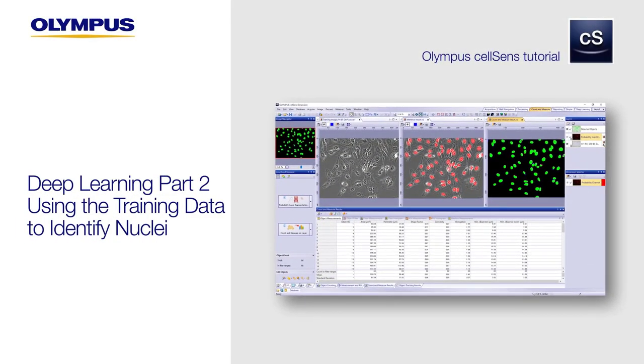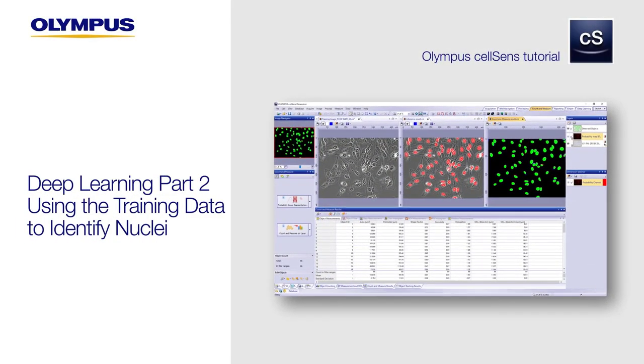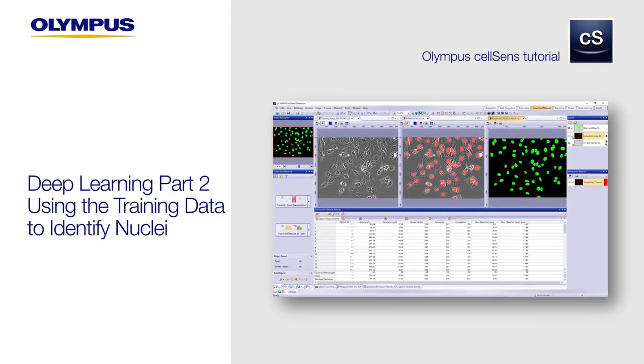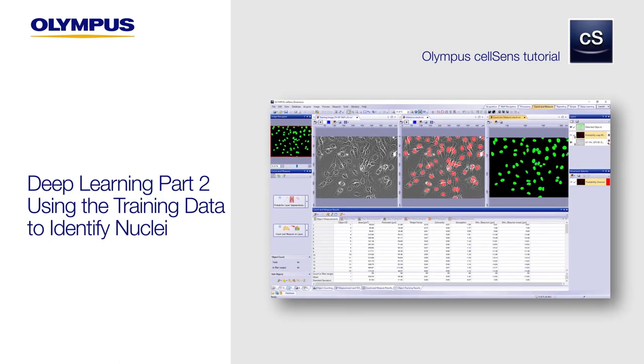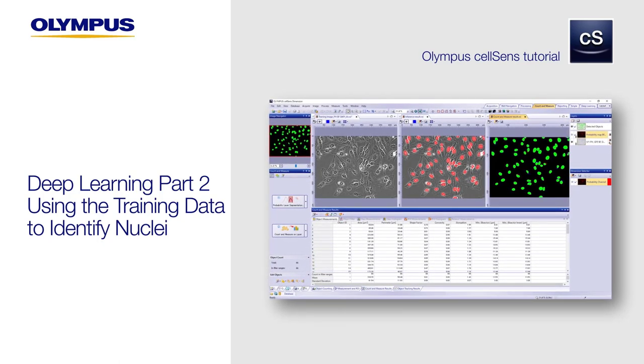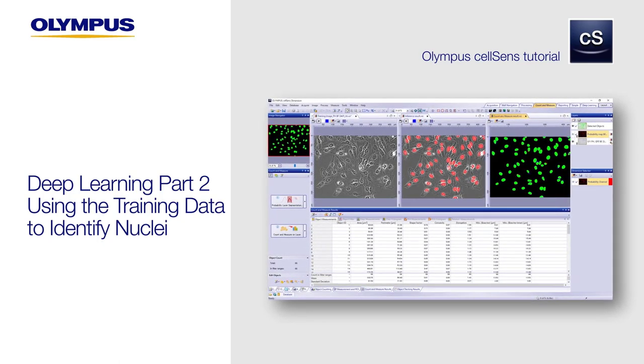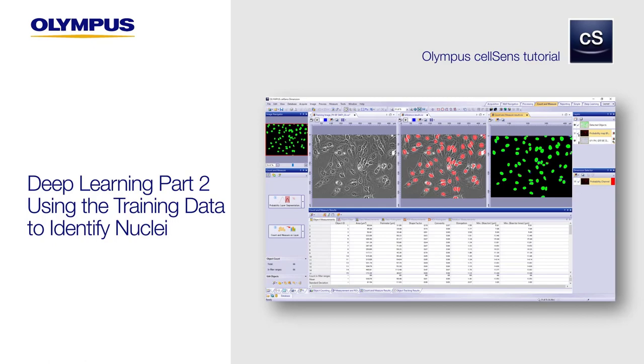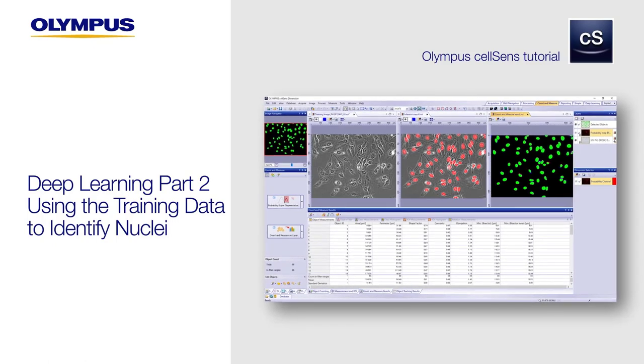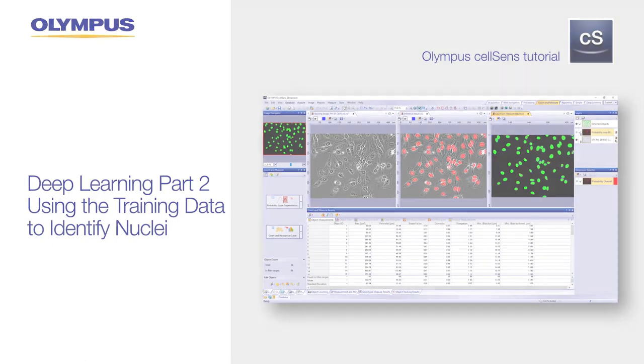In this second video of our two-part Deep Learning Technology video series, we'll show you how to use the training data we created in Part 1 to set up your software for label-free nucleus detection.